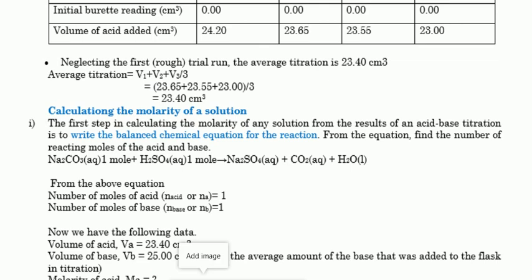Kwenye hii table nilikwambia ya kwanza it's pilot. Kuchukua ile ya kwanza ya juu minus chini unapata pilot hapa. Ya pili it's volume 1. This is volume 1. Ya pili it's volume 2. I mean ya tatu is volume 2. Na hii ya nne mwishoni it's volume 3.